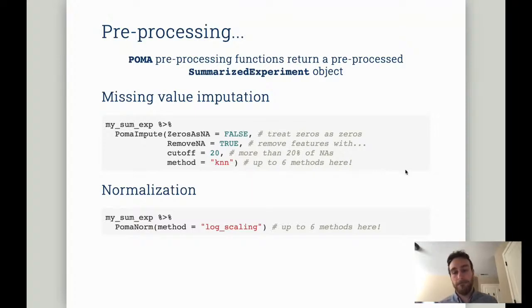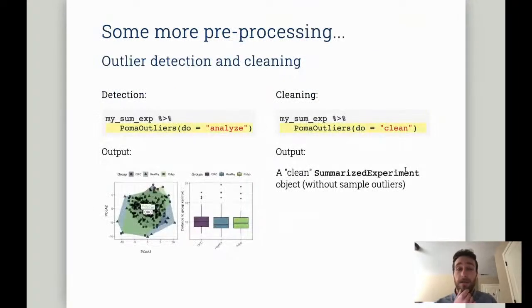But there's one step missing in this preprocessing, that is the outlier detection and cleaning. A lot of people don't like this step because it's super hard to obtain the data. And when you're told we have to remove some samples from the data, it's like, no, please, we cannot do that. But I understand that sometimes, depending on our purpose, maybe we should do that. It's not mandatory, but sometimes depending on our purpose, we should consider removing some samples from our data.